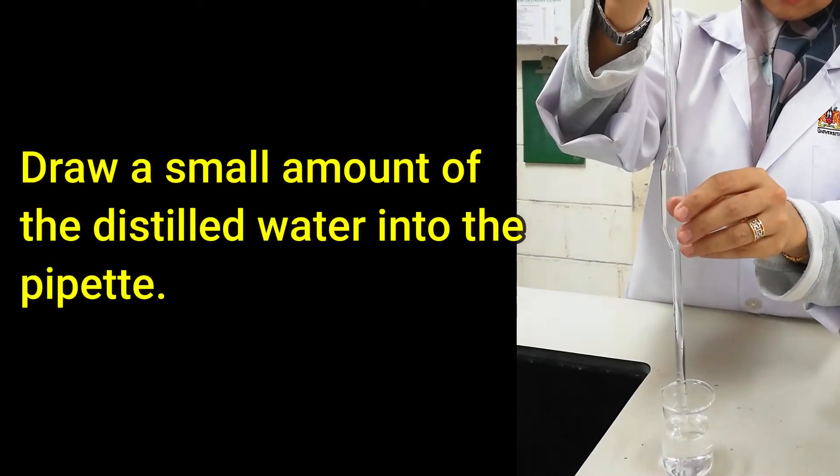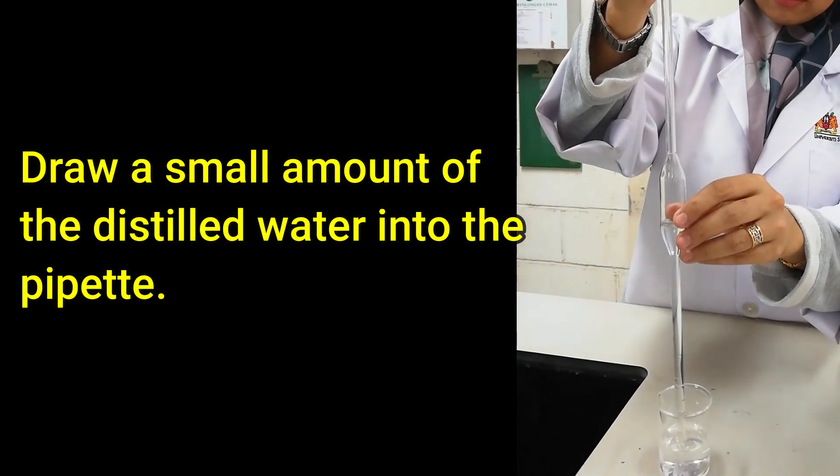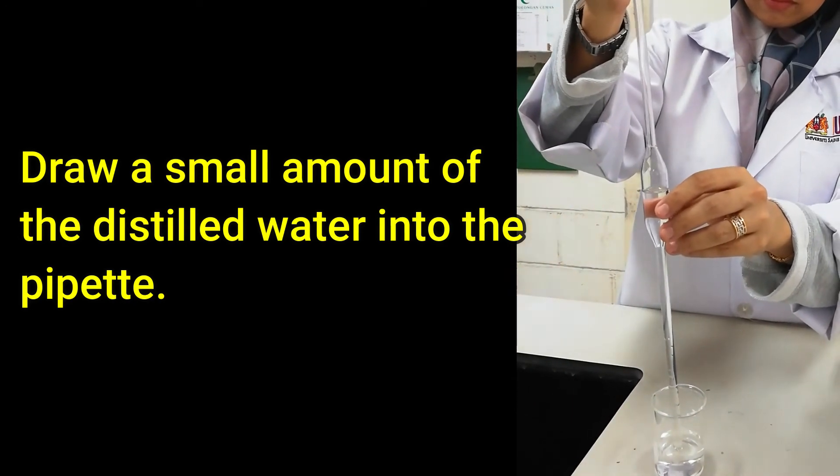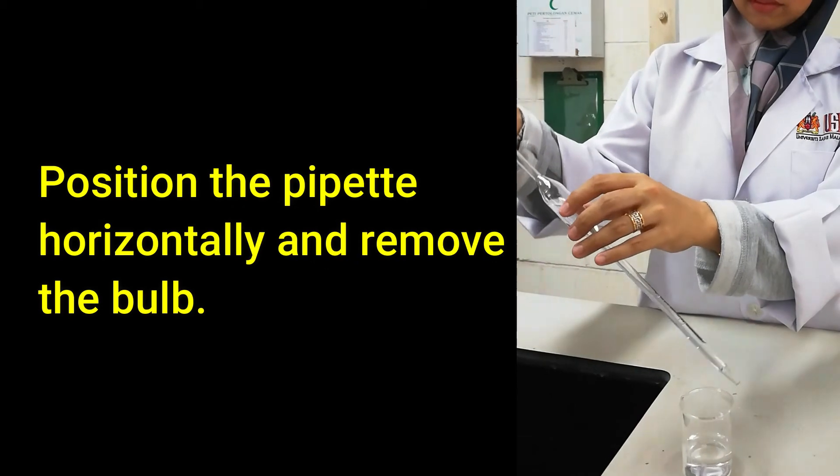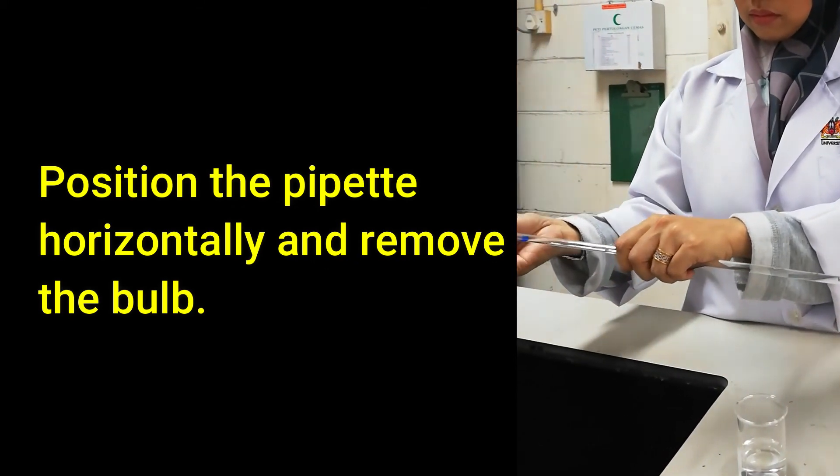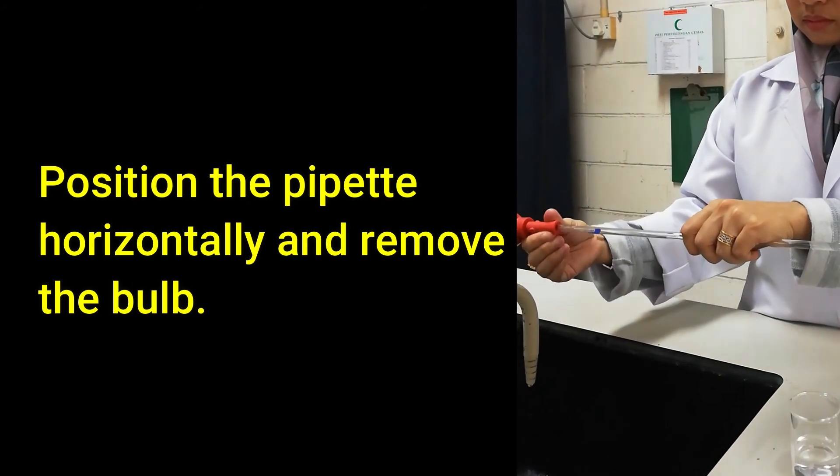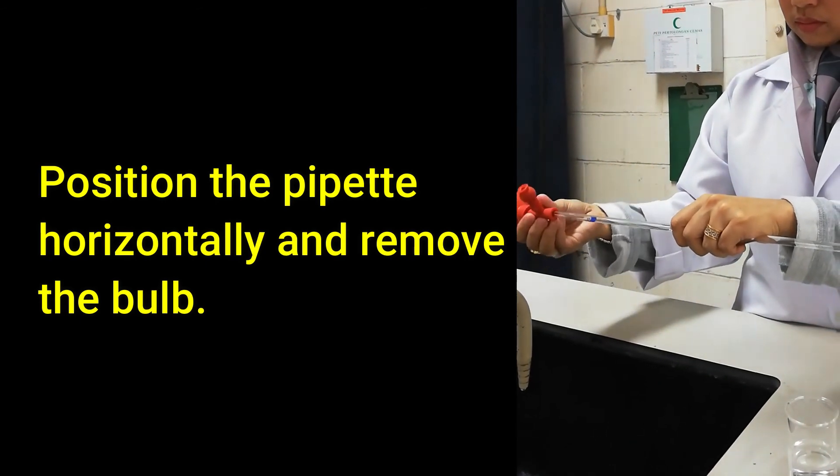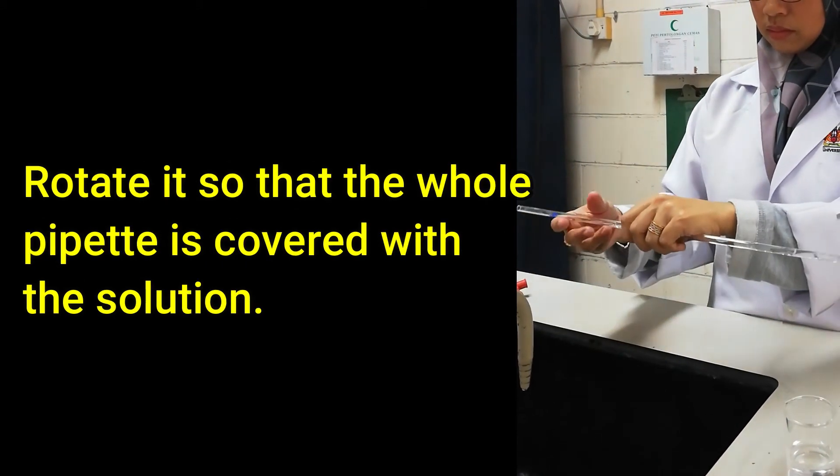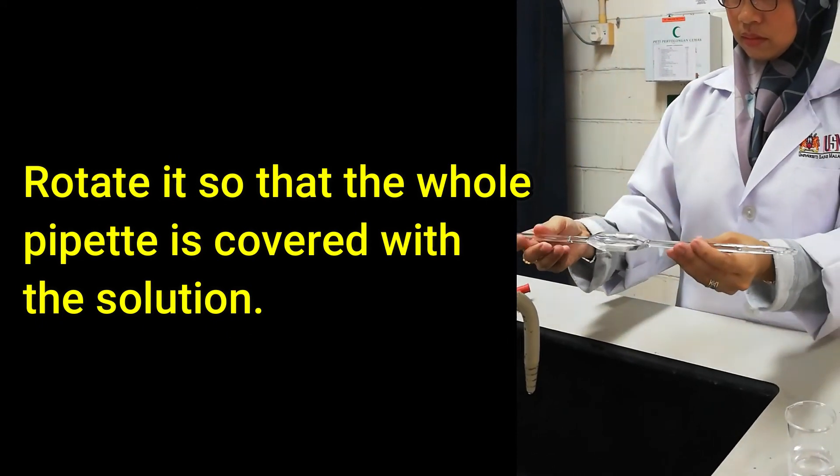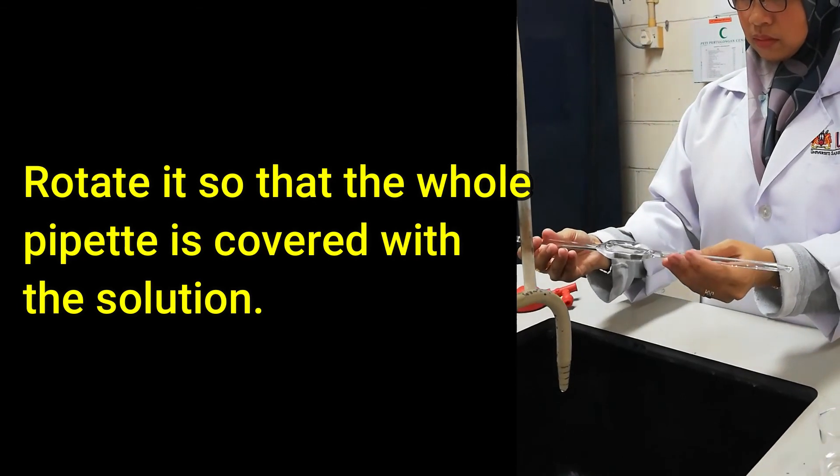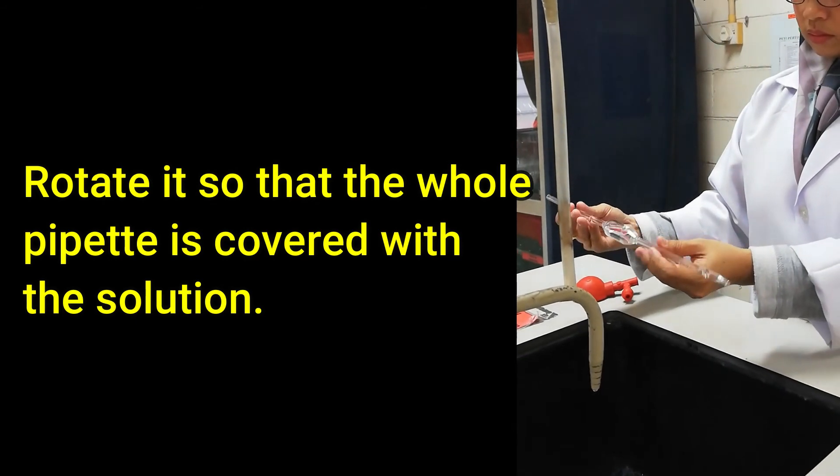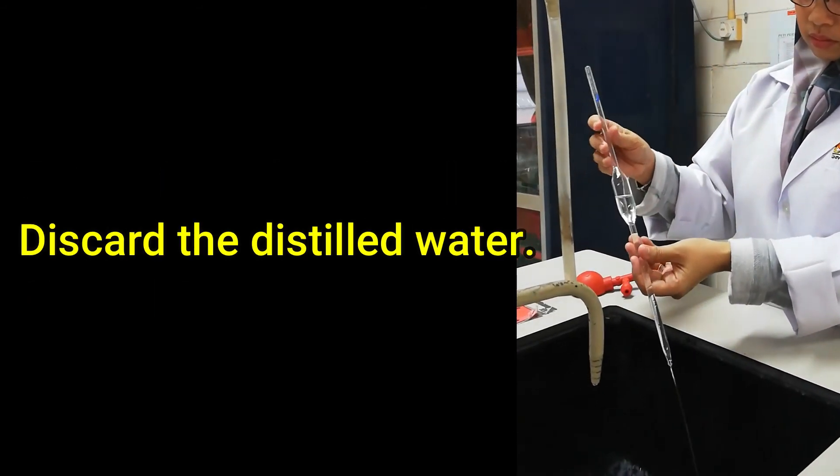To rinse the pipette with distilled water, draw a small amount of the distilled water into the pipette with a pipette filler or pipette bulb. Remove the pipette filler or pipette bulb and close the opening at the top of the pipette with your thumb. Then, position the pipette horizontally. Rotate the pipette so that the whole pipette is covered with distilled water. Discard the solution.